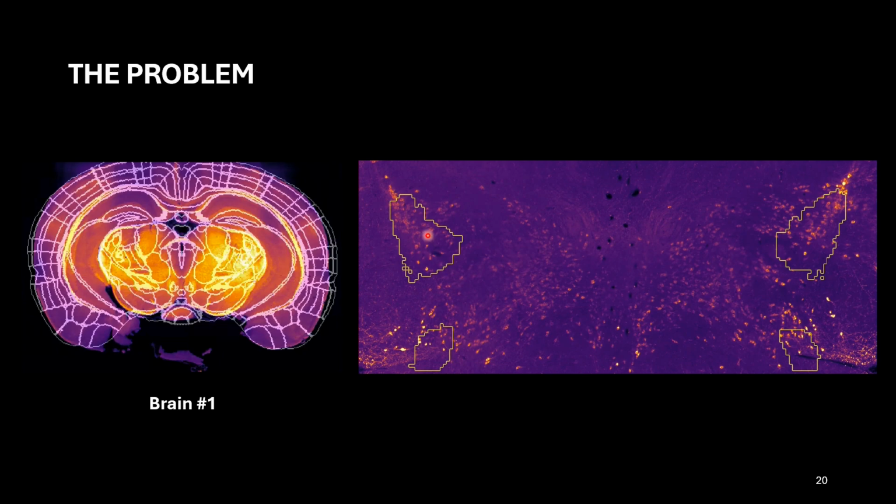But when we first started analysing it, we didn't know if these cells were also meant to be in the region, or what about all of these? So, we were asking the question of have we just completely missed the region? Well, the answer is apparently that all of the surrounding regions around the SNpc are also expected to have positive cells, which makes our lives a lot more difficult because now we don't know where the boundary begins and where the boundary ends for one region to another.